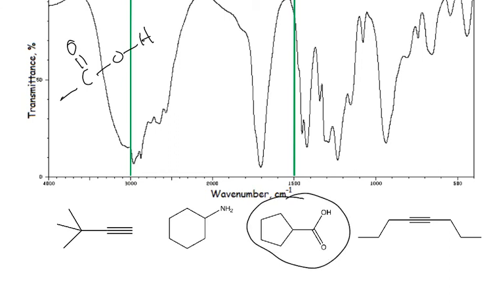The other thing to notice about the carboxylic acid is that we also have the big high-intensity peak around 1700 wave numbers, and that's the CO stretch in the carboxylic acid. So when you have the big, broad, hairy beard and the CO stretch at about 1700 wave numbers, that's the signature that we're dealing with the carboxylic acid.